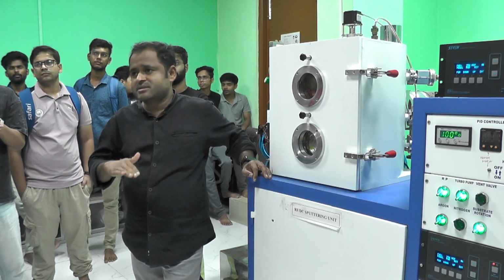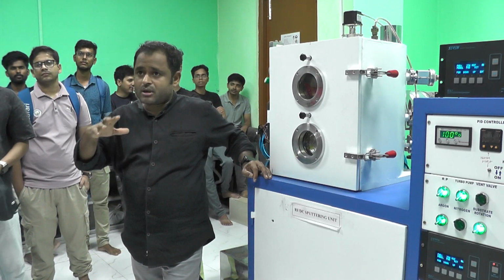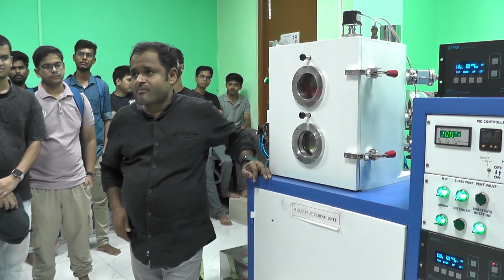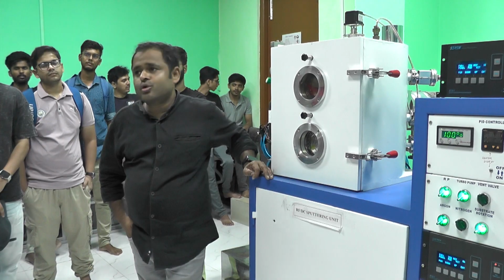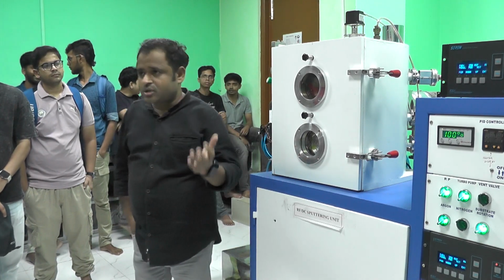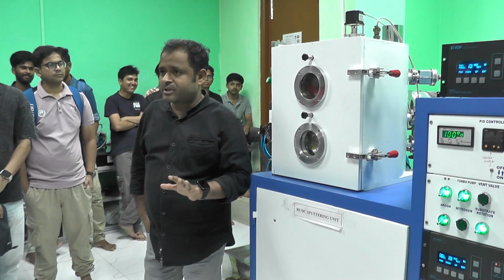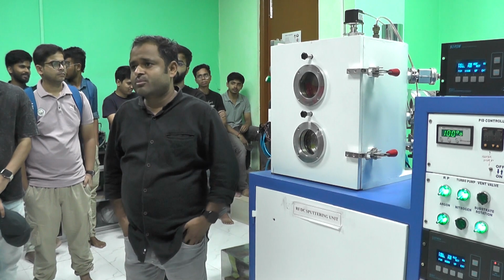We have optimized almost all targets. Will every target be the same? No. For GST it is different, for other materials it is different. For different materials, you have to do optimization.